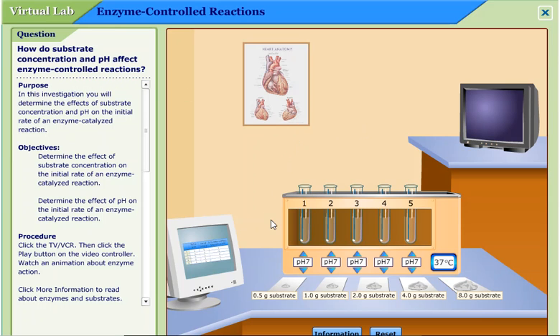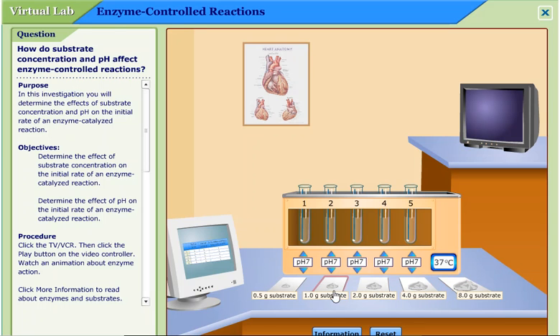Let me first explain the setup here. Inside each of these test tubes there is a liquid. Inside that liquid there is an enzyme called amylase. Amylase ends in A-S-E as most enzymes do. Amylase is an enzyme that's found in our saliva, and the job of amylase is to break down starch. These little powders on these papers here represent starch — different amounts of powdered starch. We're going to be adding them to the amylase in the test tube and looking for color changes, then looking at the actual number of molecules the substrate is broken down into.